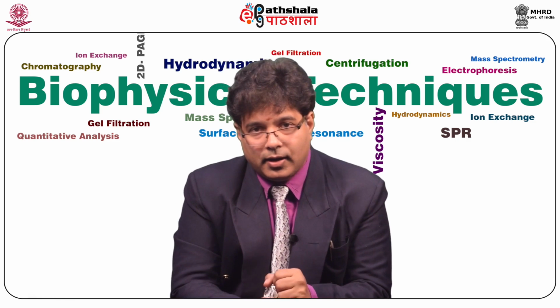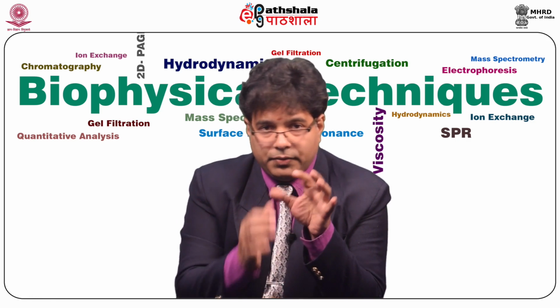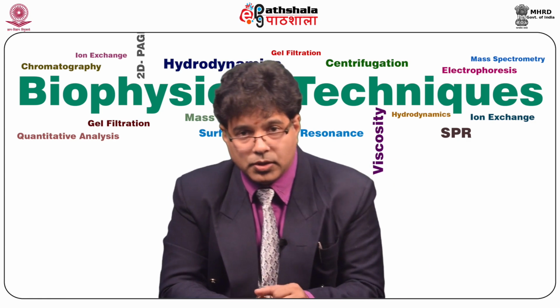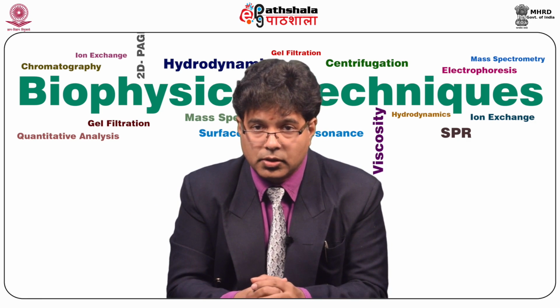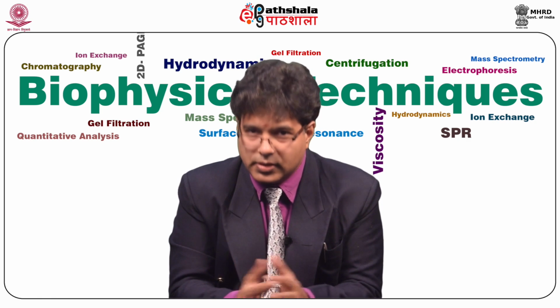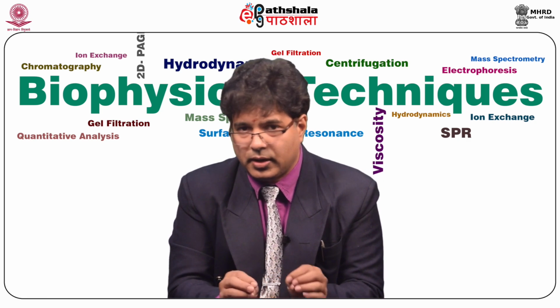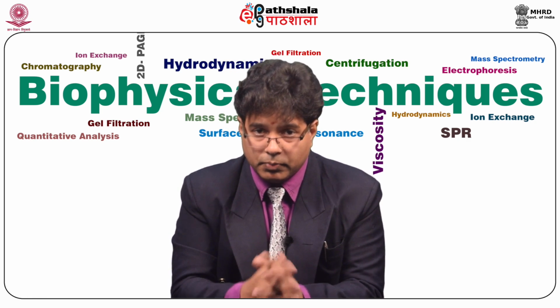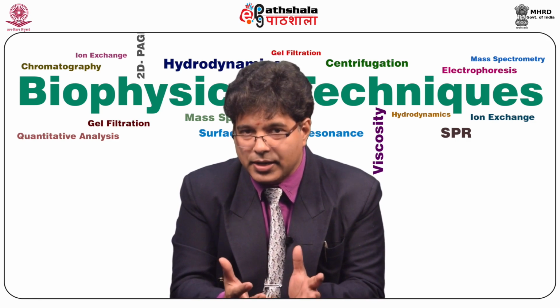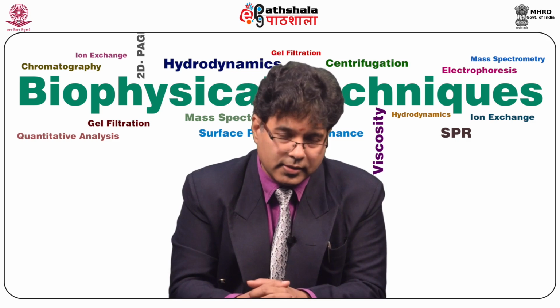So students, let me just summarize what we have learned so far from this module. We have seen the evolution of mass spectrometers right from J.J. Thomson towards the commercially used mass spectrometers we see today, and the fundamentals of mass spectrometers: on what basis we are separating them, how we are classifying them, and the parts of mass spectrometers. We have just seen the preliminary angle about the parts of mass spectrometers, the types of mass spectrometers, their resolution, dynamic range, and mass accuracy, etc. In further lectures, I will explain the rest of the things. Thank you very much.